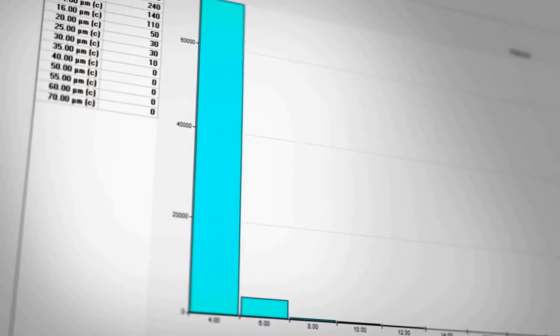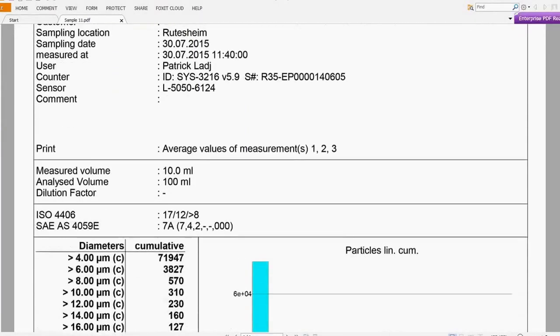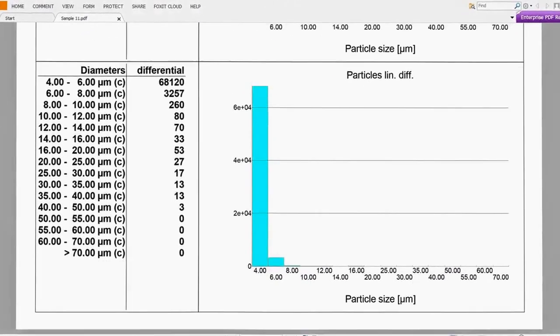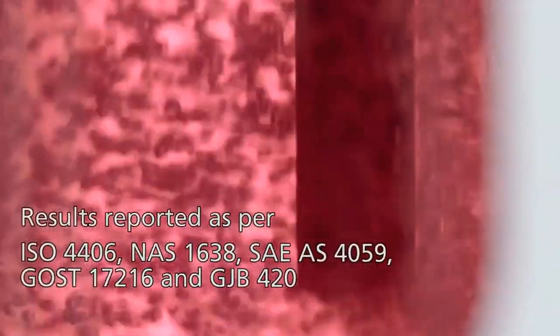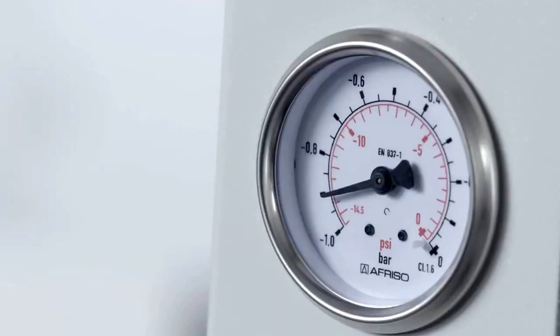PAMAS's own software enables automatic data storage of the results. The results are displayed numerically or graphically. All measuring results can be displayed and reported according to common cleanliness standards.